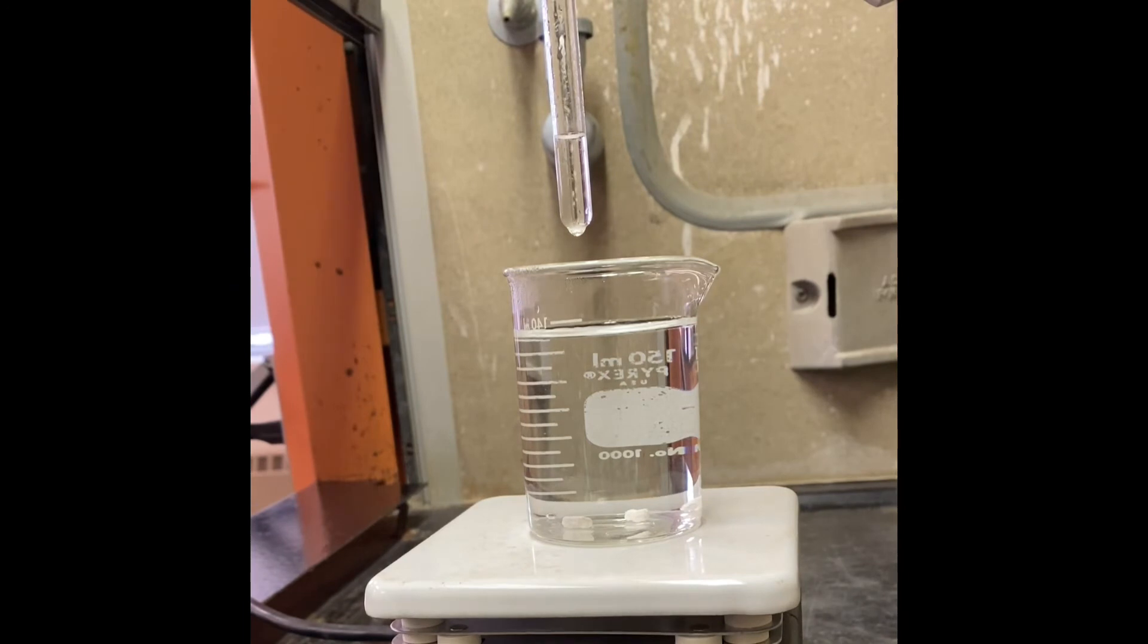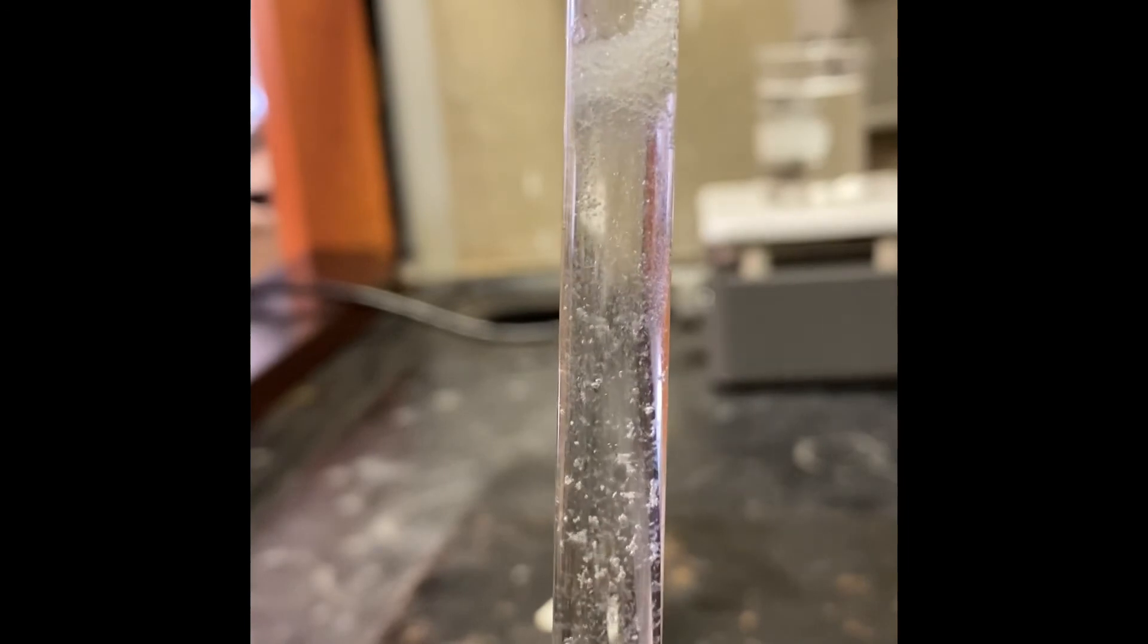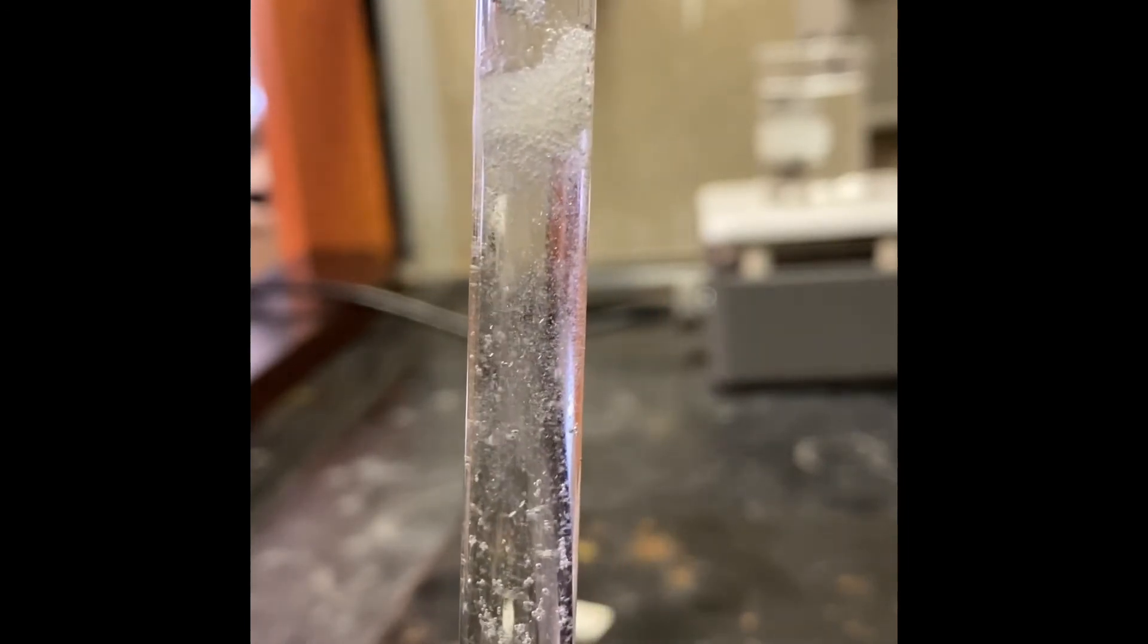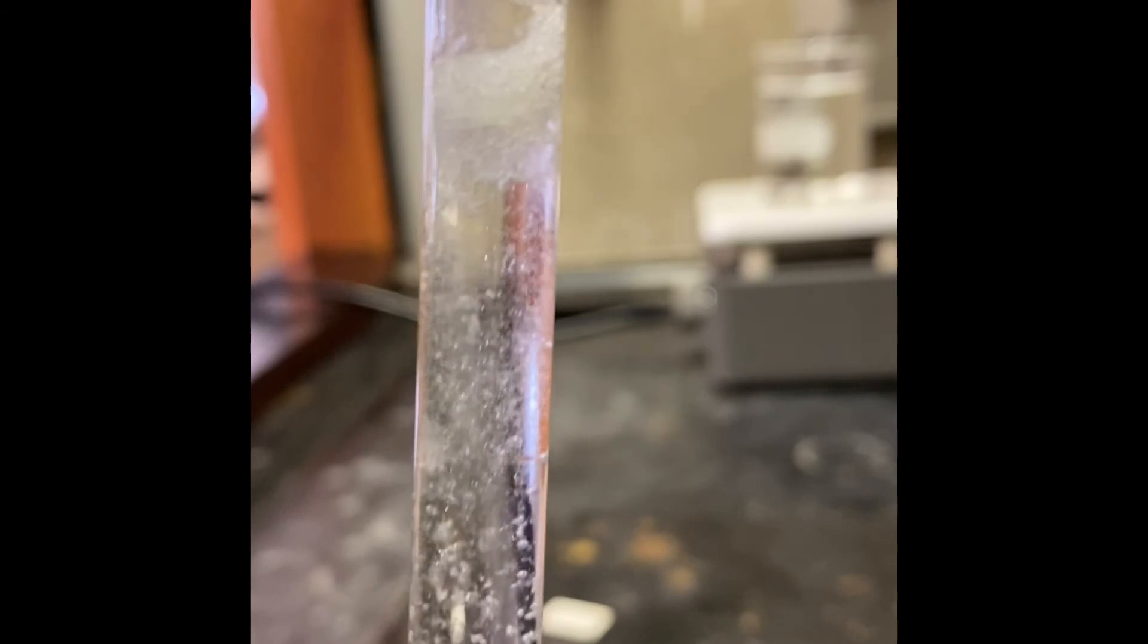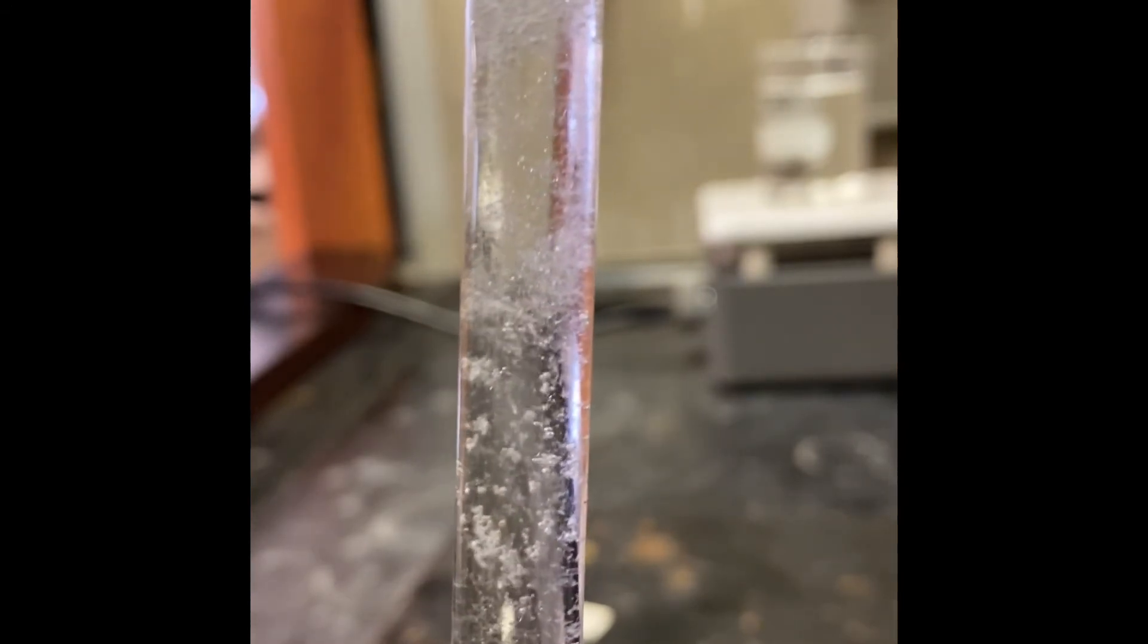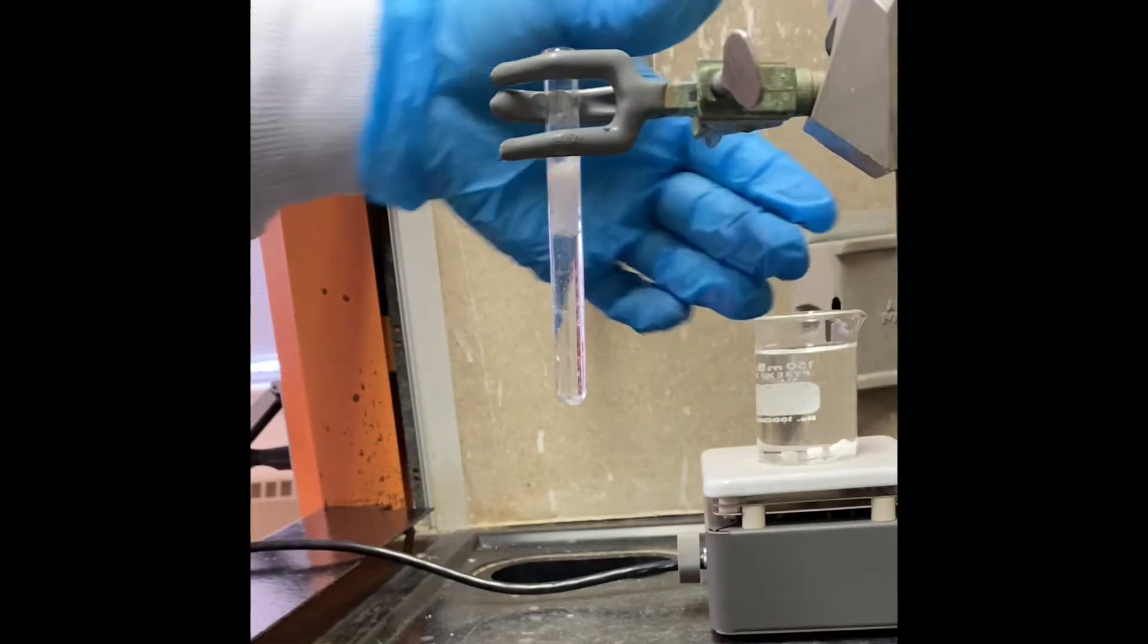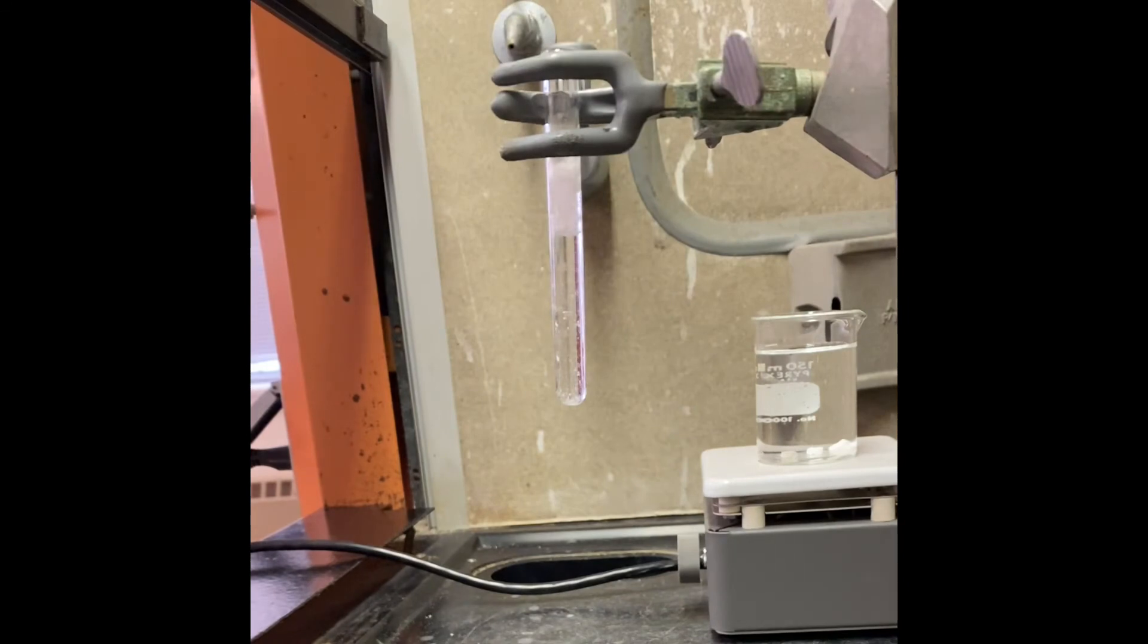After reaching the boiling point, we'll add some water until we get a cloudy reaction mixture. So slowly we're going to add water drop by drop. After adding water until getting a little cloudy, as you see, our product starts to form. That's how our reaction looks like now.